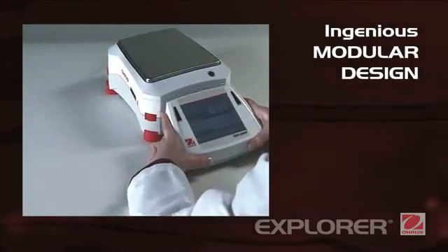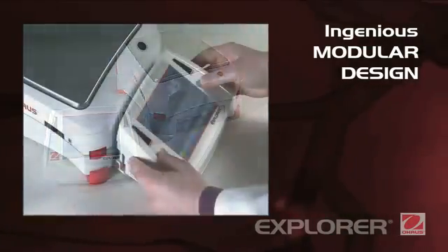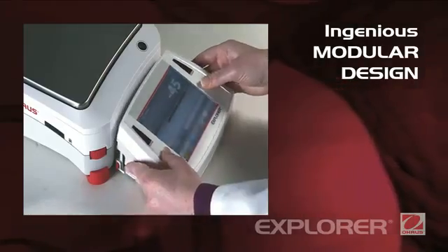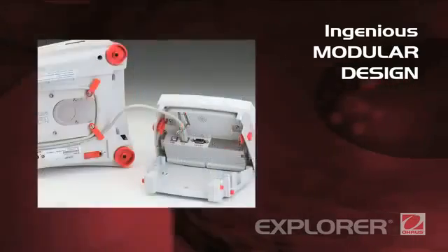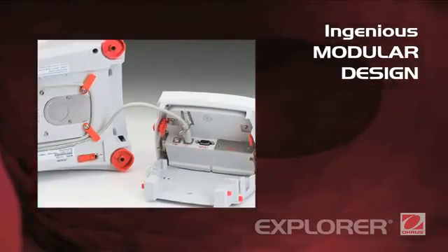Ingenious modular design. Explorer's modular design features a color touch display that can be separated from the weighing base. The display can be adjusted for optimal viewing, or it can be mounted on the wall or on its optional tower accessory. A robust die-cast metal base features an integrated cable storage system.